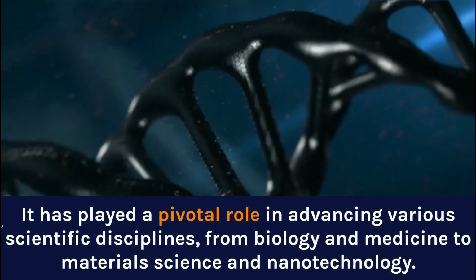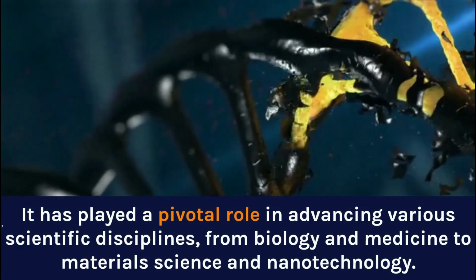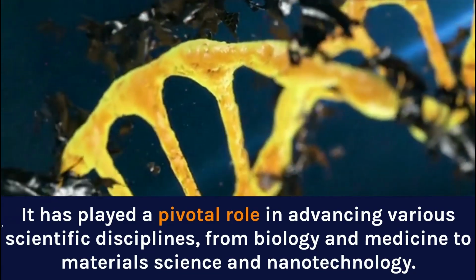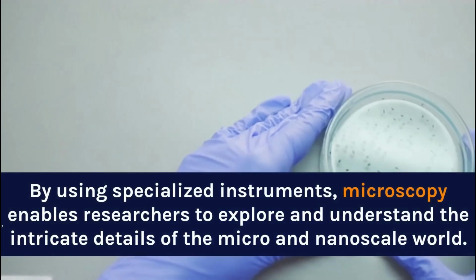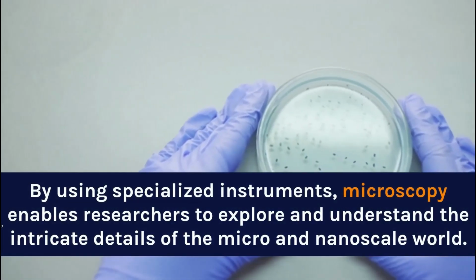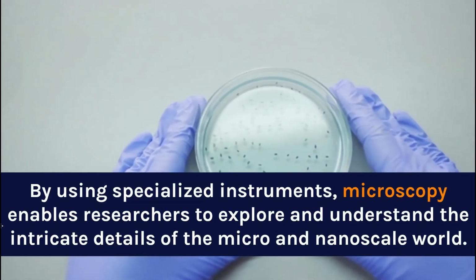It has played a pivotal role in advancing various scientific disciplines, from biology and medicine to material science and nanotechnology. By using specialized instruments, microscopy enables researchers to explore and understand the intricate details of the micro and nanoscale world.